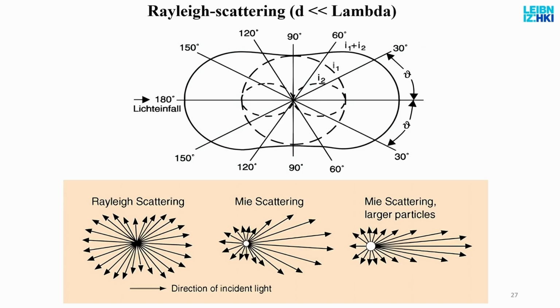And you will learn soon that the typical wavelength for fluorescence microscopy that we use in visible light is a few hundred nanometers. So this type of scattering, called Rayleigh scattering, occurs when your object is a few nanometers in size. It's a symmetrical pattern, looks like a number 8, a little bit like a baby biscuit.